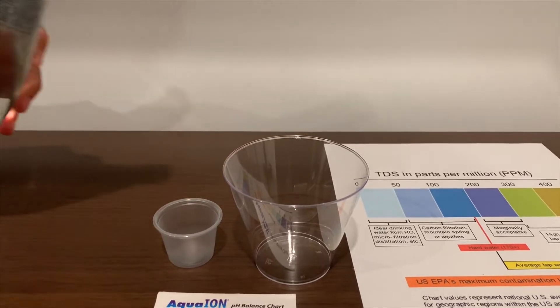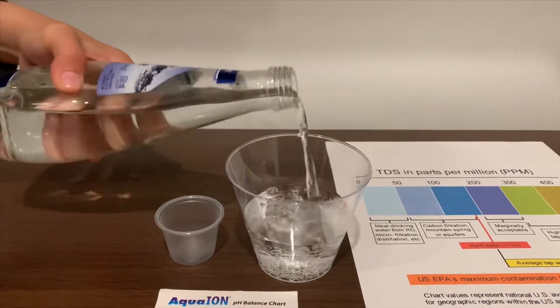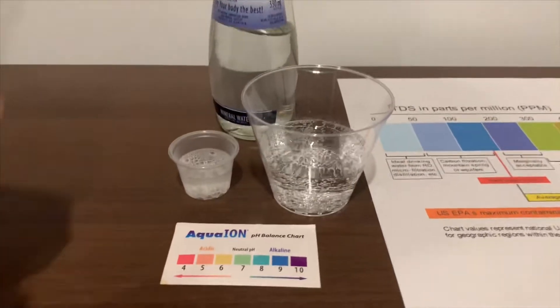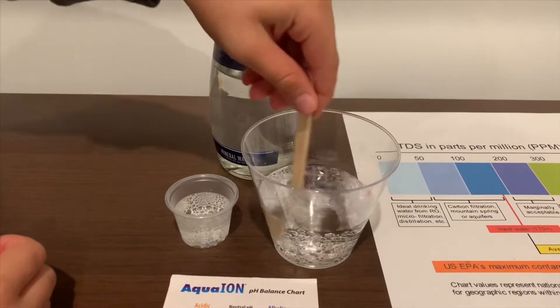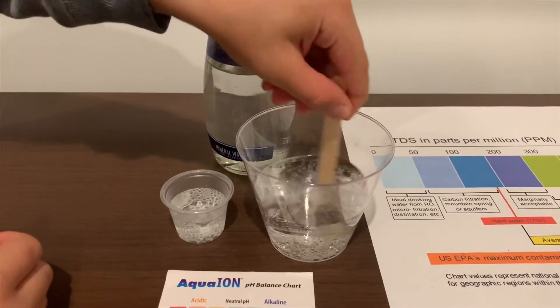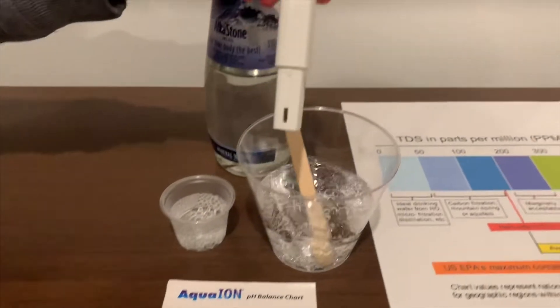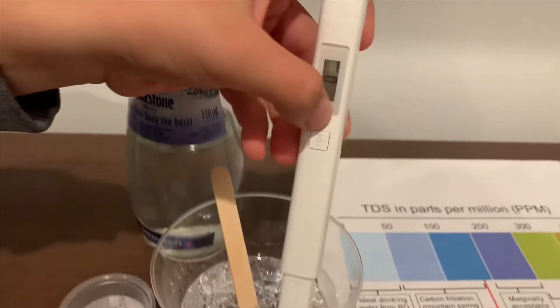Let's pour some water in. Let's stir it a little so we'll know better what the TDS level is. If you want to buy this TDS tester, the link is down below. Turn on the TDS tester, make sure it says zero and let's put it in.